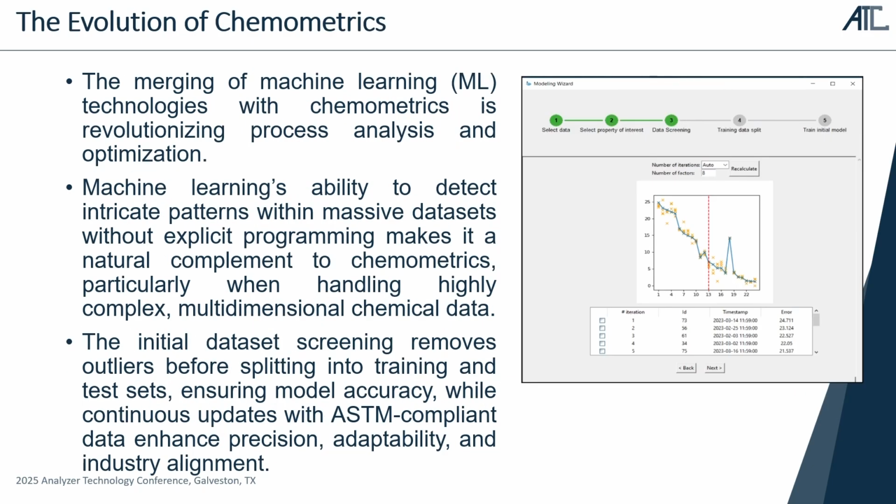Today, we have a more powerful solution, which is based on machine learning. And this powerful solution enables us to not only use the bias for the models correction, but also to rebuild these models. We can rebuild these models using one single additional sample, which was observed as one which does not have the required agreement with the analyzer results.